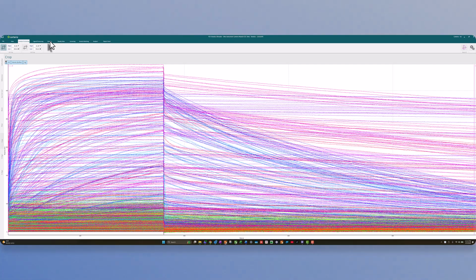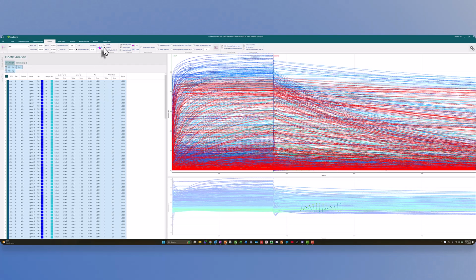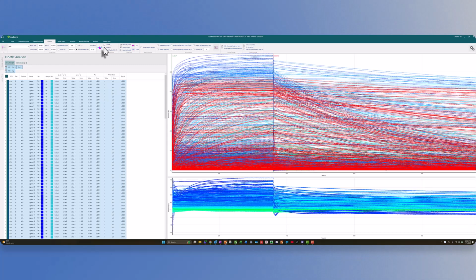We'll select the Kinetics tab, Kinetics Analysis, and we want to ensure that the float T0 is selected in order to properly fit the non-regenerative kinetics data. This data set has some bulk shift, so I will also include the bulk shift parameter. Make sure the green bar is all the way to the left, and the red bar is at the first data point after the start of dissociation. We're now ready to fit the off rate and on rate.